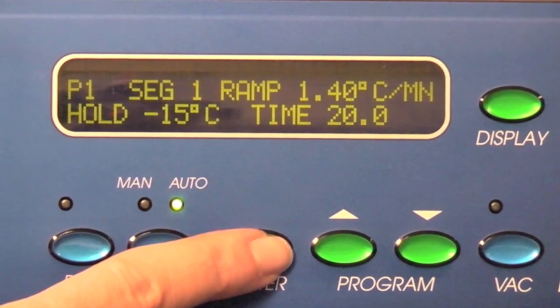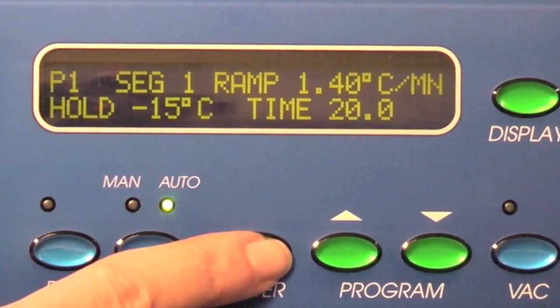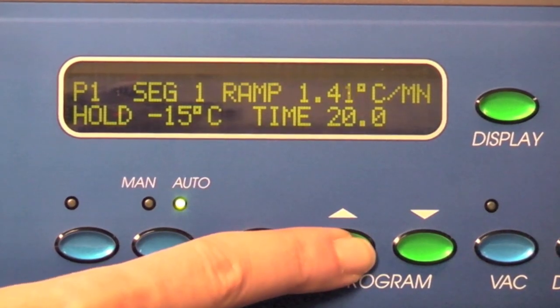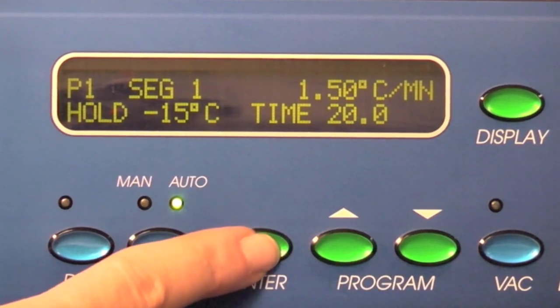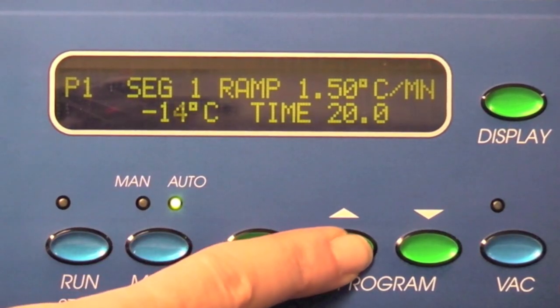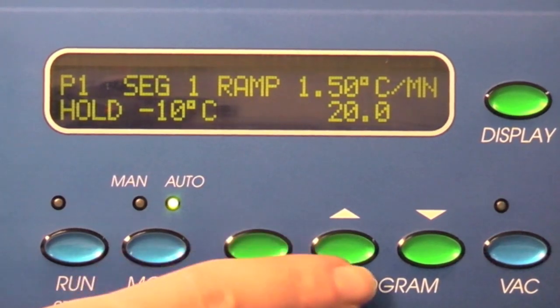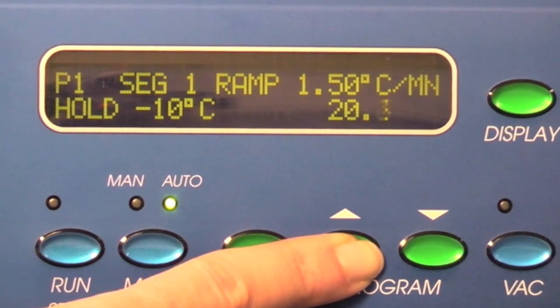This is the primary drying step. The shelf temperature should be slightly colder than the eutectic temperature of the sample. Push enter until ramp is blinking and enter 1.5 degrees per minute. Push enter again until time is blinking and set the time to 24 hours. Press enter to store the parameters.